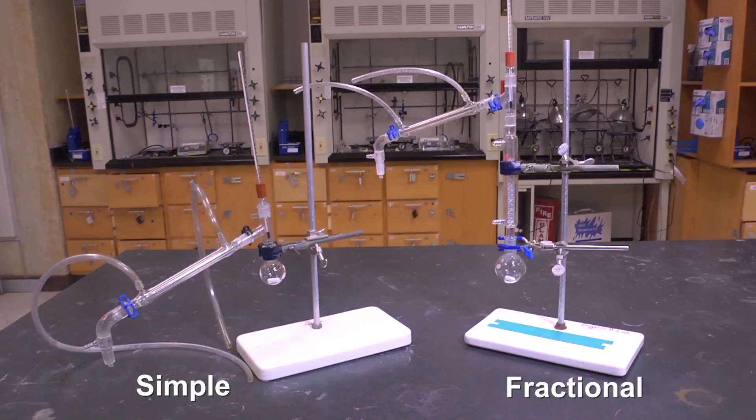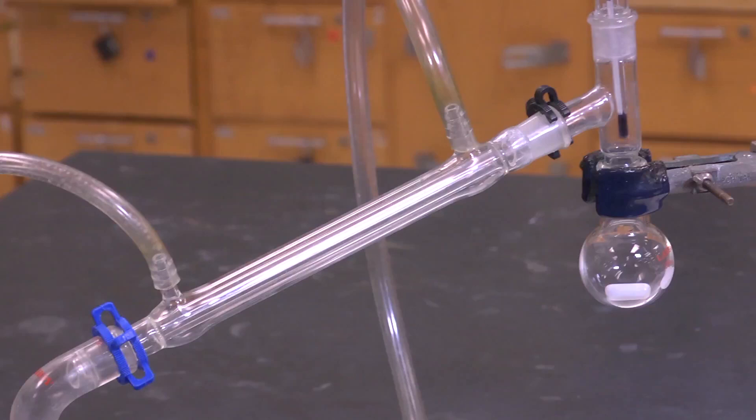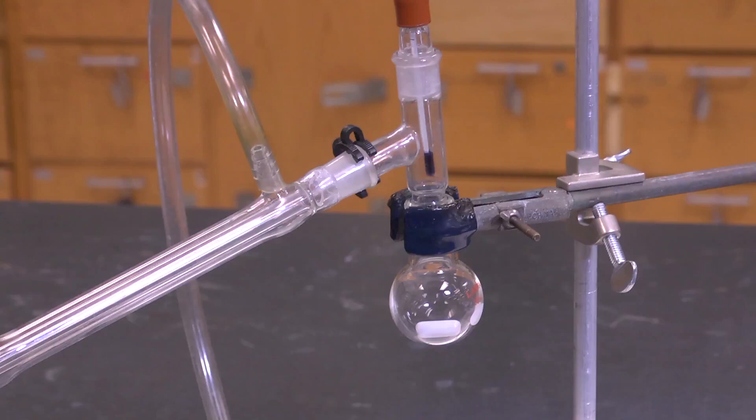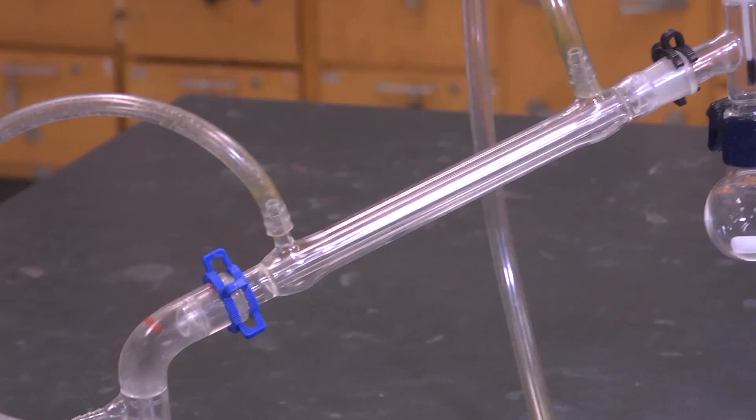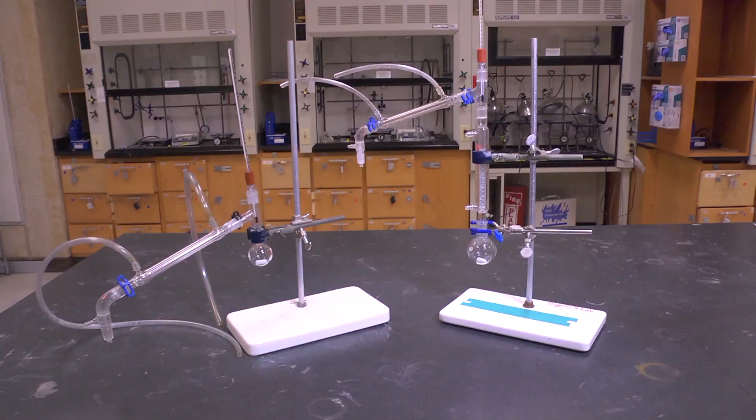Simple distillation is suitable for separating liquids with large boiling point differences. The substance with the lower boiling point will be distilled off first with reasonable purity so long as the boiling points have a large enough difference. Simple distillation takes less time than fractional distillation. And if need be, purity can be increased by performing a subsequent distillation on the purified product.